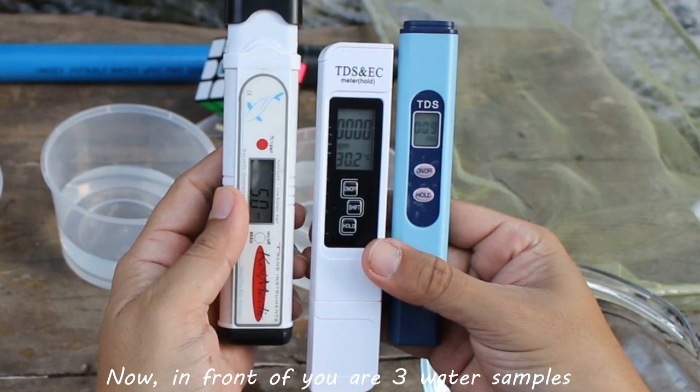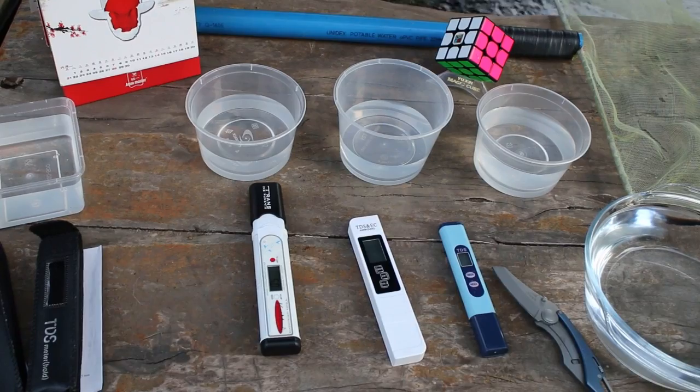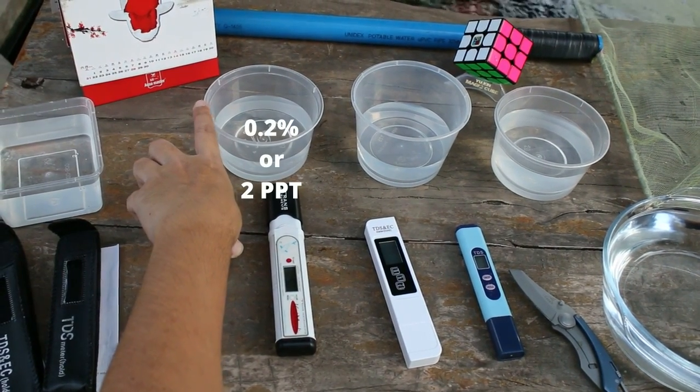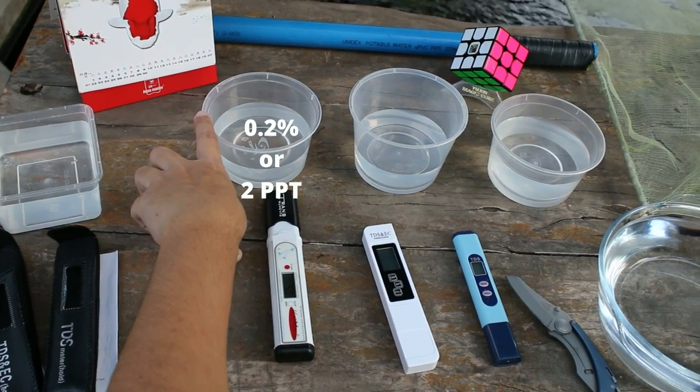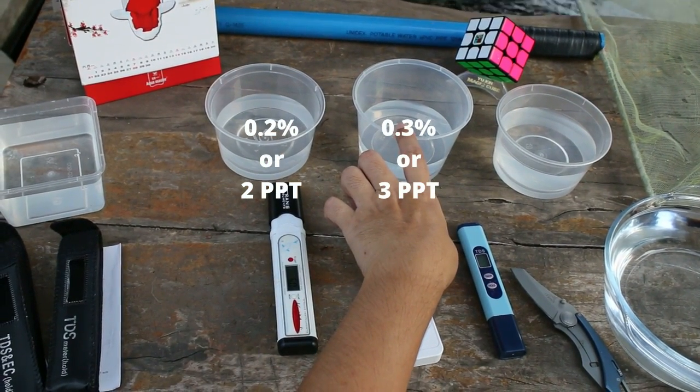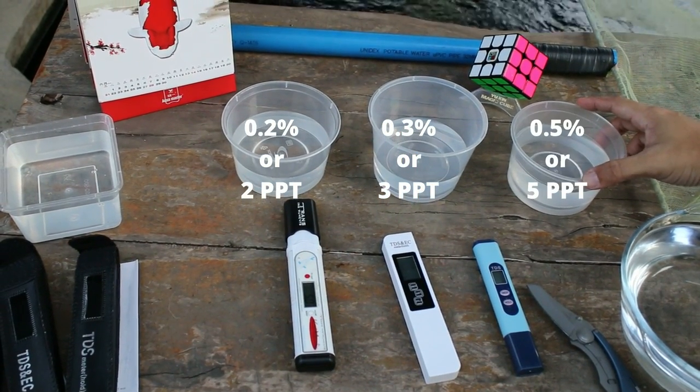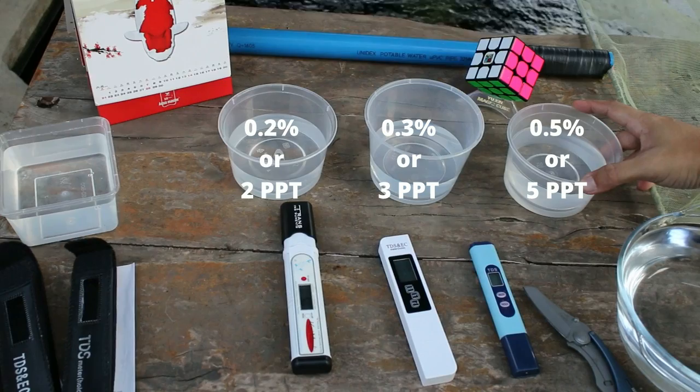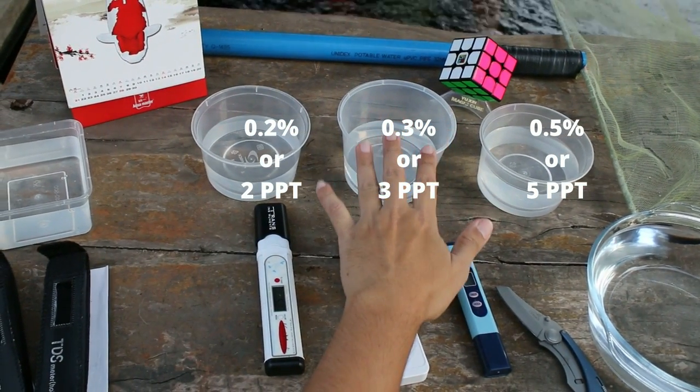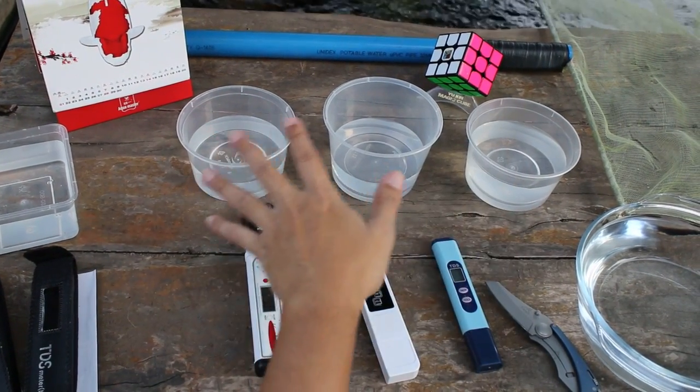In front of you are three water samples that I have prepared. The one on the left has 0.2% salinity, the one in the middle has 0.3% salinity, this one here on the far right has 0.5% water salinity. So again, 0.2, 0.3, and 0.5. We are going to measure this with each of our devices.